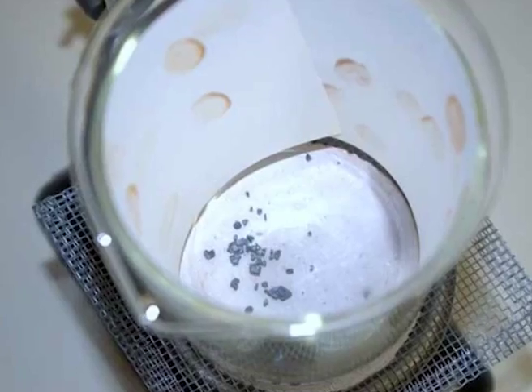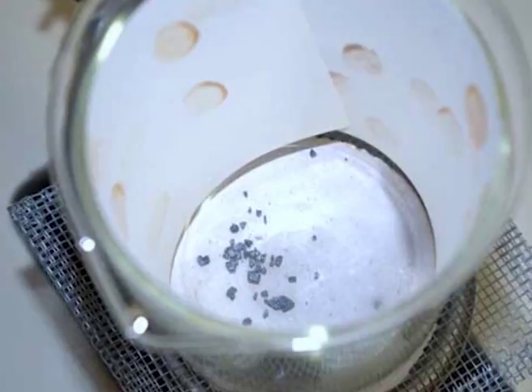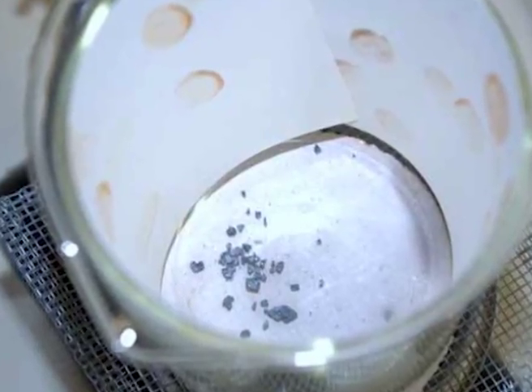An iodine fuming gun is made of either glass or plastic. The butt end of the gun contains a dehydrating agent, usually calcium chloride. There is also a mouthpiece for blowing air at this end. Near the nozzle end of the gun, about 0.5 grams of iodine crystals are placed.